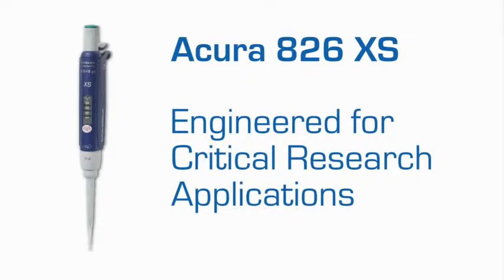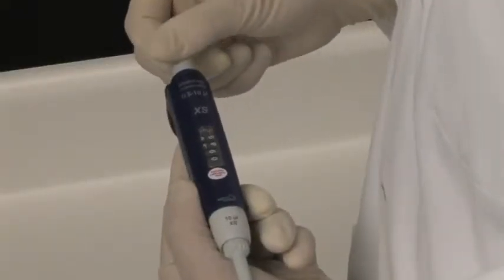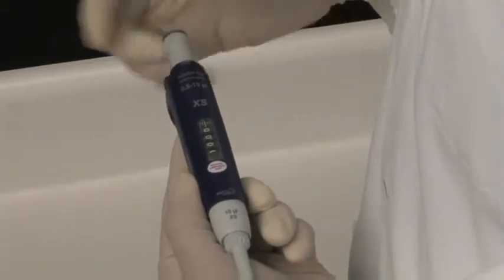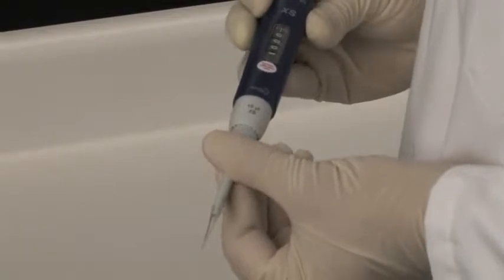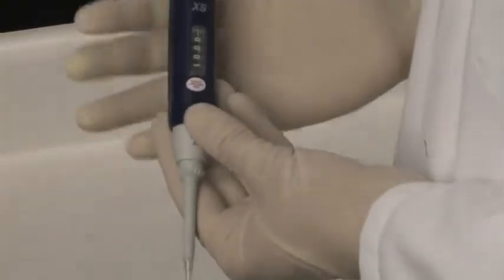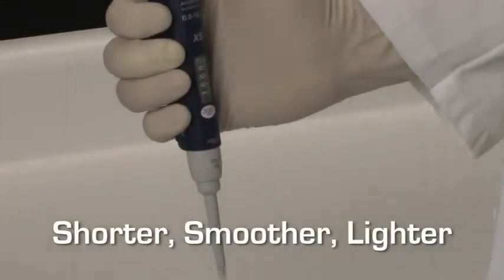The new Acura 826 XS is specifically designed for research applications to make working with critical samples trouble-free and more precise. While providing all of the standard features of the Acura manual line of pipettes, including precise setting and checking volumes, as well as user-friendly tip adjustment to accommodate a variety of tips, the 826 XS is shorter, smoother, and lighter.